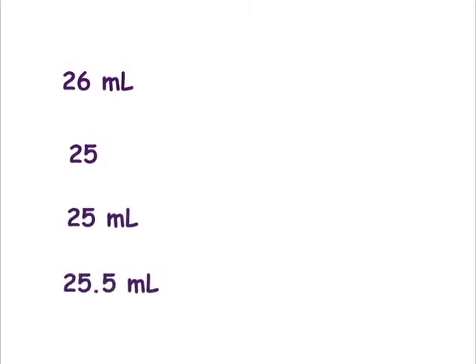Now that you have made your measurements, let's see how you did. Let's put some of your possible measurements up on the board. 26 milliliters, 25 milliliters, 25.5 milliliters, 25.4 milliliters, 25.5, 26. Okay, let's see how we did.